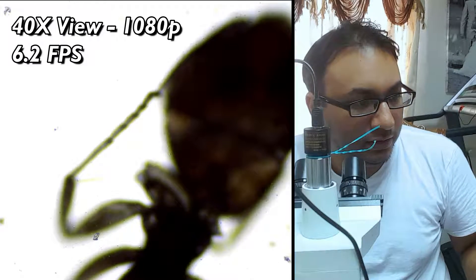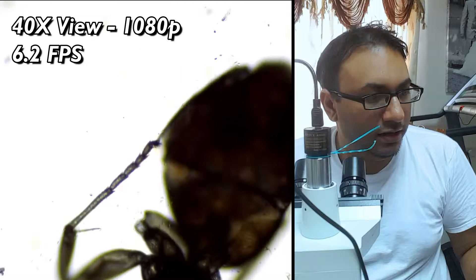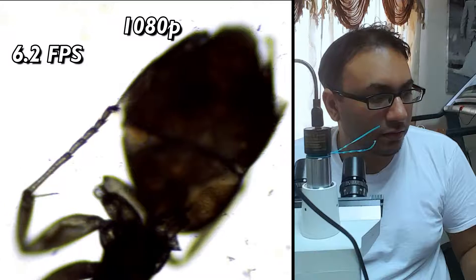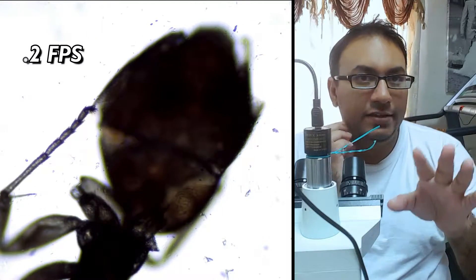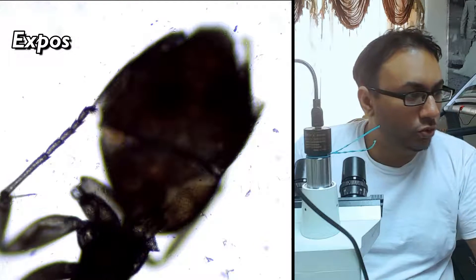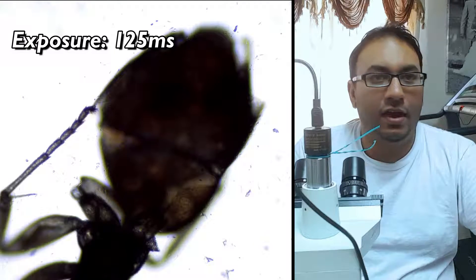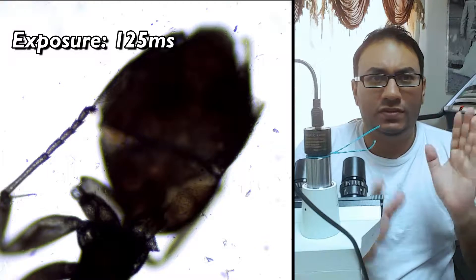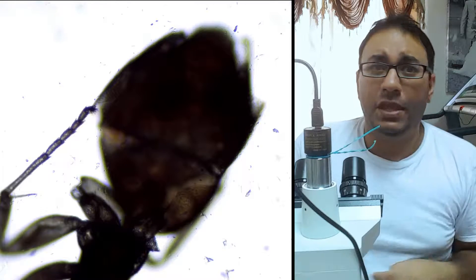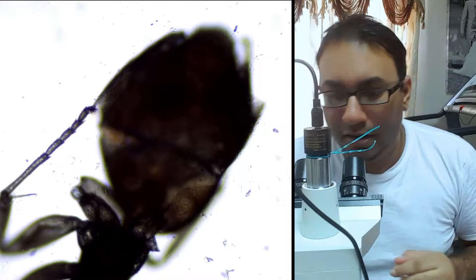This should be 1080p. The frame rate currently is 6.2 frames per second, so this is what you could expect. I had to manually set the exposure time on this camera to 125 milliseconds. There's a piece of software that also comes with it where you can adjust things, but what you're seeing here is mostly not adjusted, with the exception of the exposure time being 125 milliseconds — that's to keep it bright.